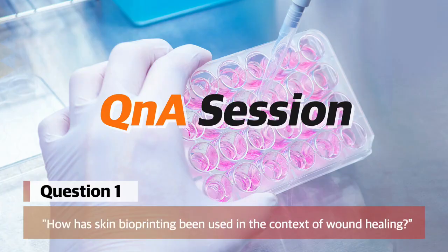I could address one question that was asked in yesterday's session, which specifically asked how the bioprinter has been used in chronic wound healing. And I showed one application actually at the very end.